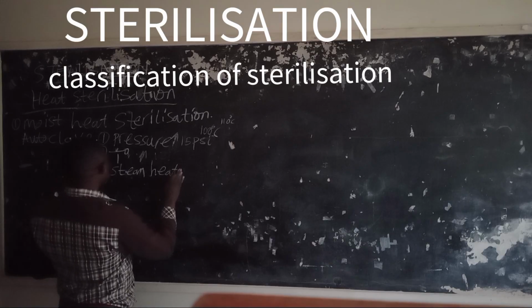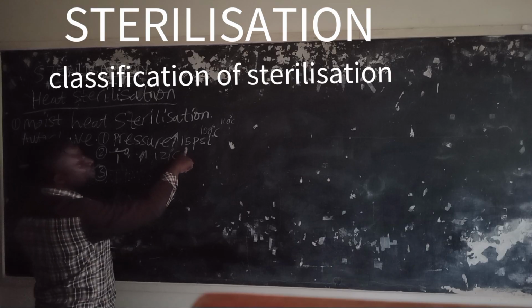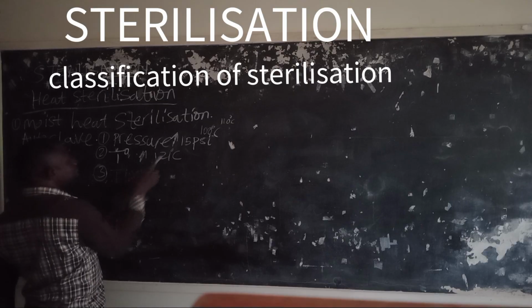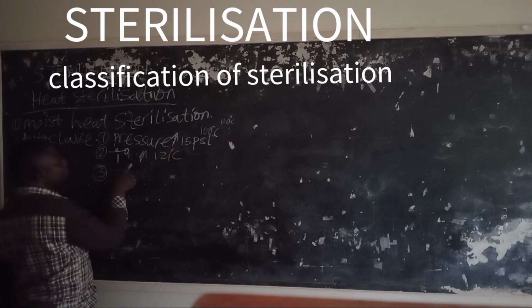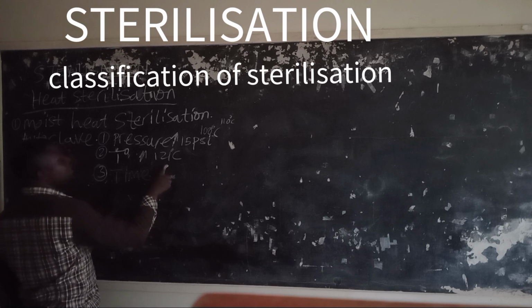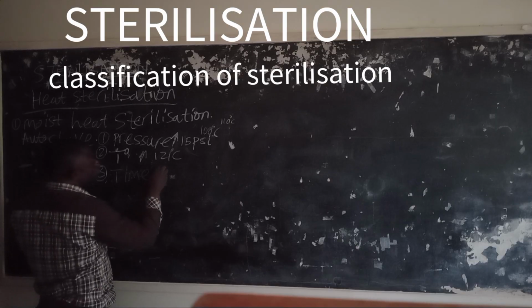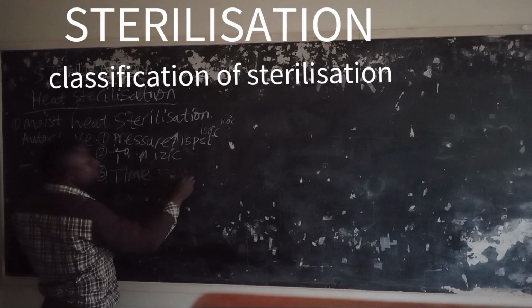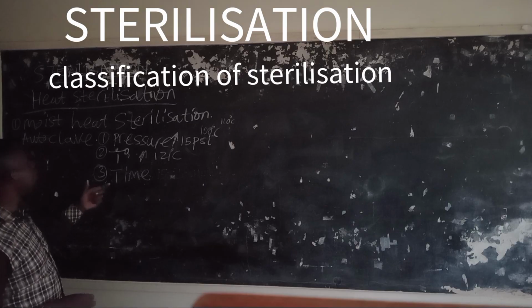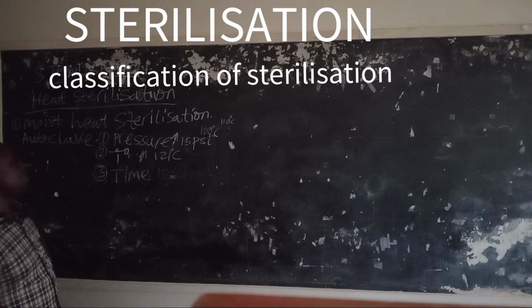Then we also talk about time. So we have increased our pressure to 15 pounds per square inch, which has increased the boiling point from 100 degrees Celsius to 121 degrees Celsius. And we shall expose these microorganisms to this condition for 15 to 20 minutes.